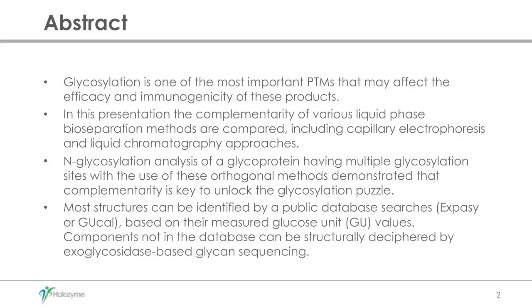Us being a small company, we contract most of our work to CROs and CMOs, so we spend a lot of time in method transfer, and if we can transfer methods that are more sensitive and simple, and the ease of use is better, that's what we all are looking for. So this is a little bit of the evolution of Halozyme, of where we started and where we want to be moving forward with our FIH program.